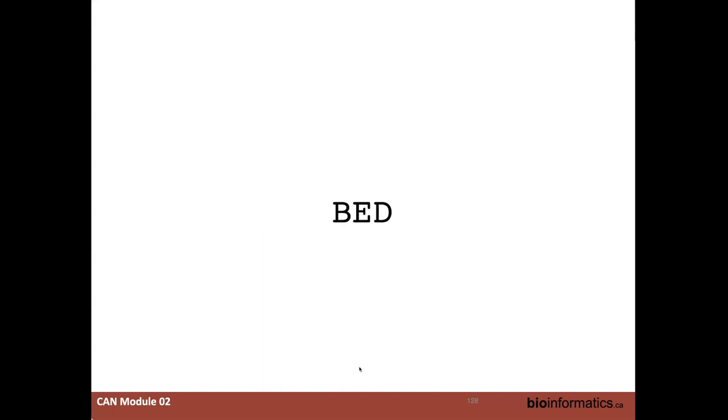Okay. Two more file formats. I'm going to go really quickly through. We're going to do some database work. So there's a question in Slack for you, Richard. Do the RD and AD numbers add up to DP for tumor samples?